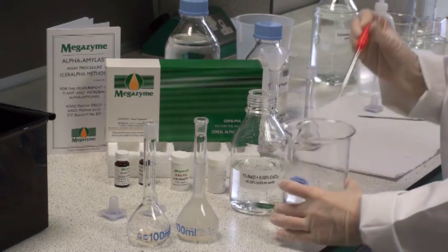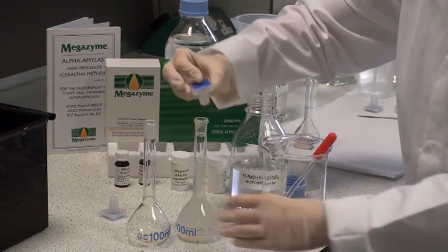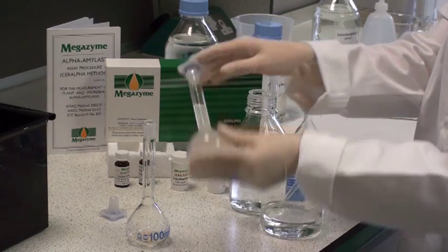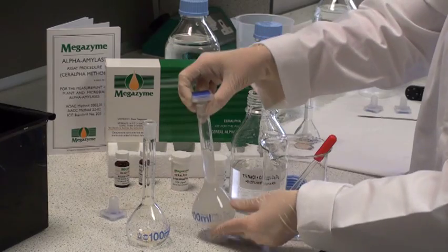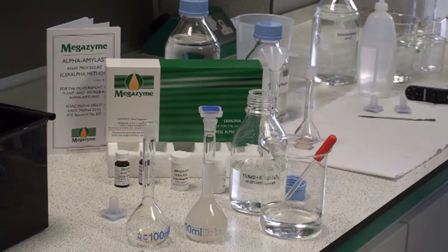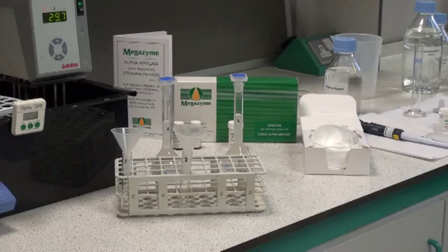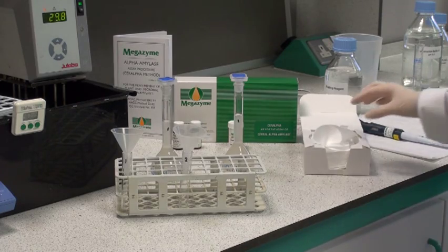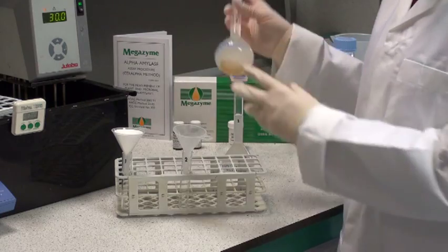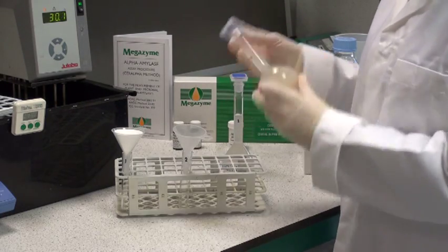Cap the flask and mix well by inversion. This will be left for 15 to 20 minutes at room temperature to allow complete extraction of the enzyme. Over this period of time, the flask is inverted and mixed a few times. After allowing the enzyme to extract for 15 to 20 minutes at room temperature, filter an aliquot of the solution through glass fiber filter paper.